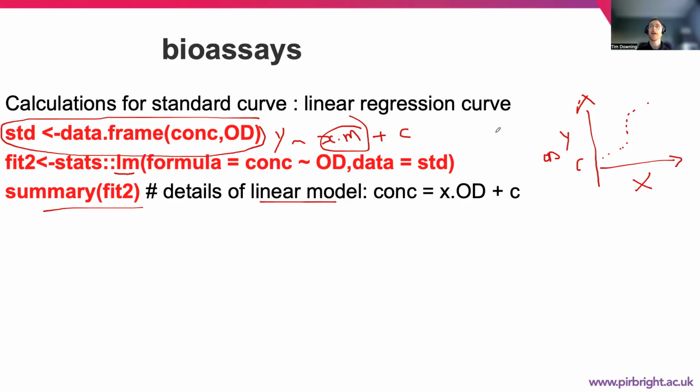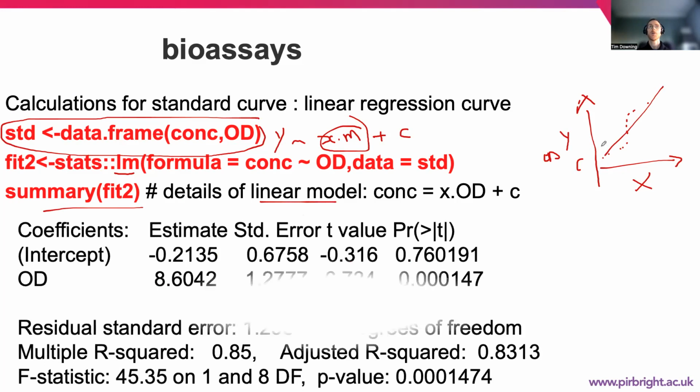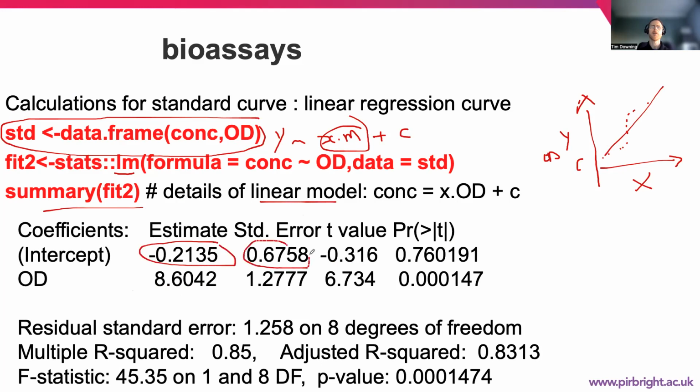So this is detailing a linear model as if X and Y were linearly related, unlike the regression model we had before. So what this shows here, for example, is that we have our intercept here, which is actually negative. This is the standard error of the intercept, which is quite large. So our intercept is negative, but has a wide range around which it can be. The t-value indicates that it has no substantial effect on Y, which is a large p-value as well.